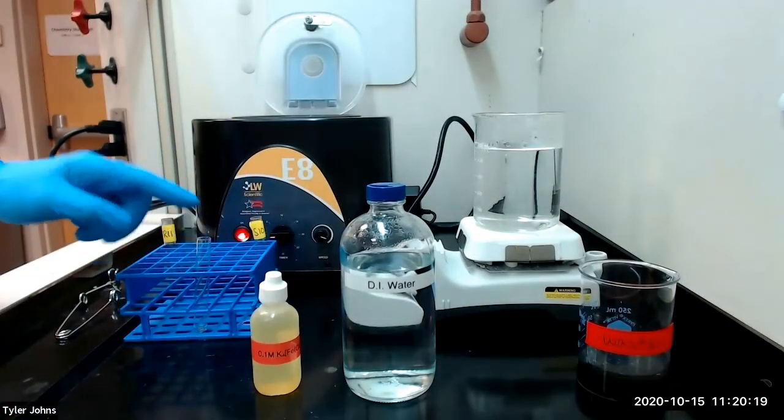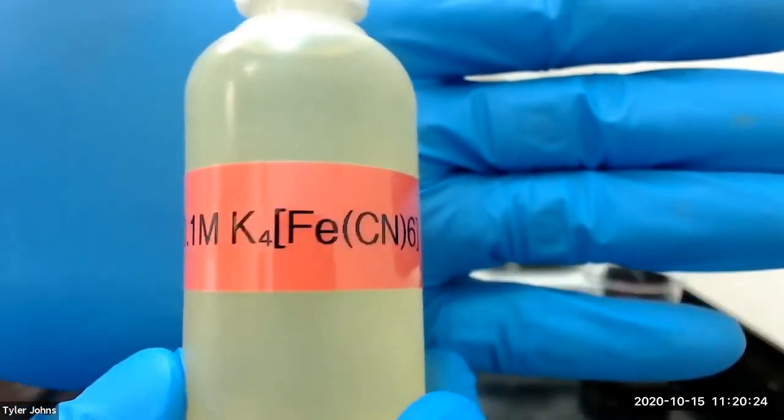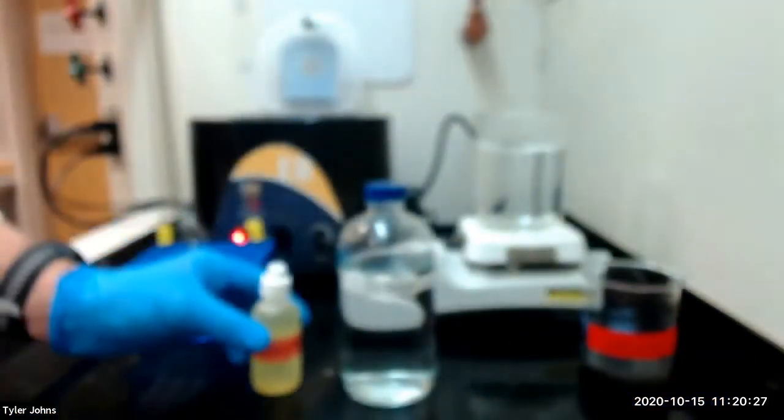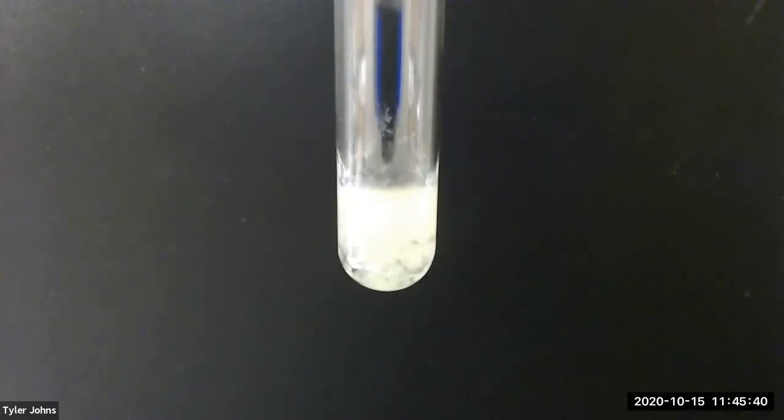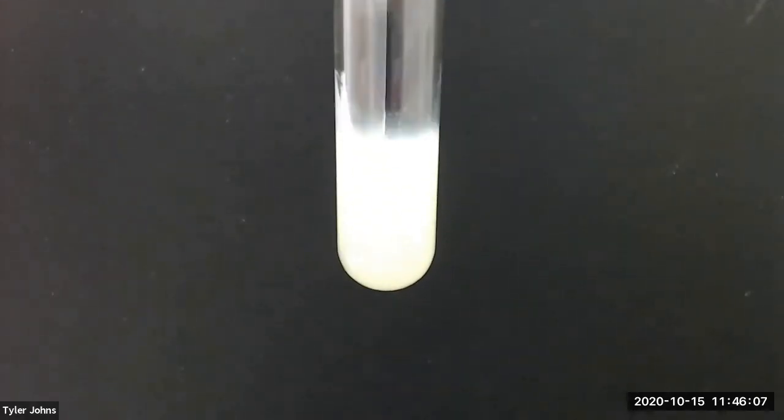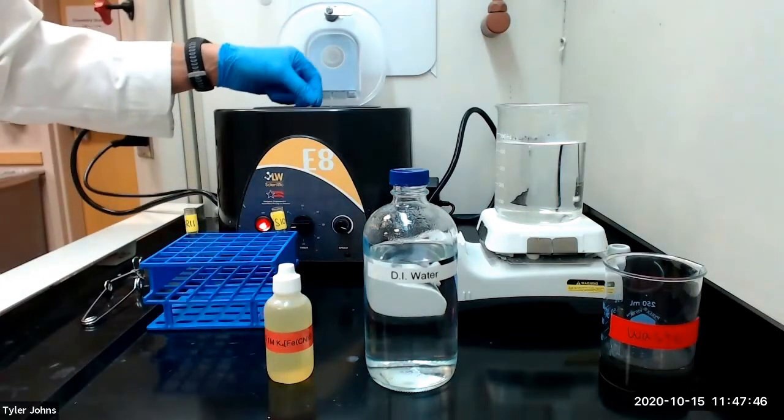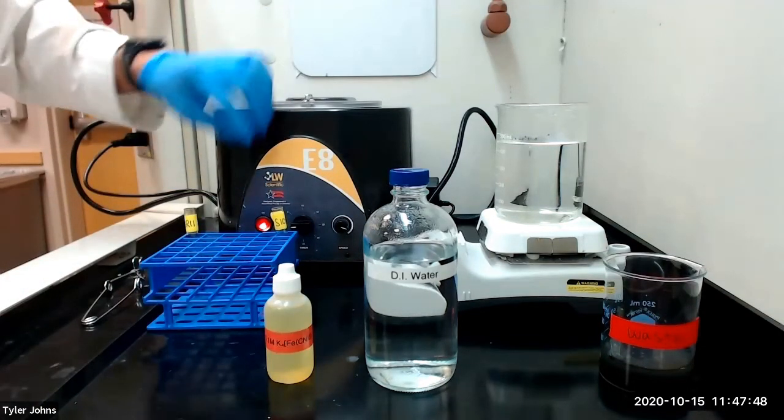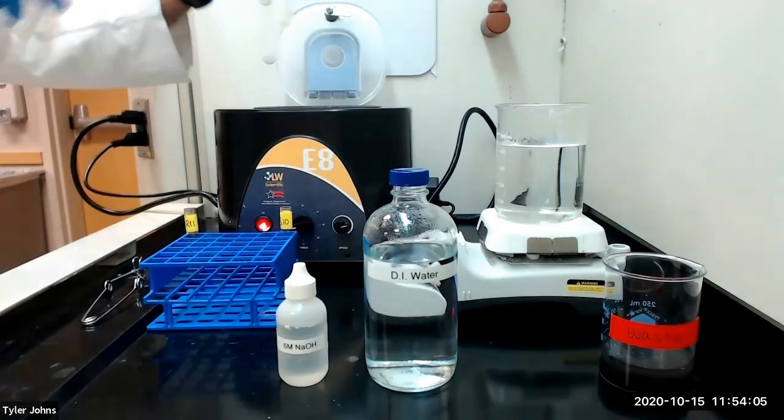To our clear solution, we will add 10 to 20 drops of 0.1 molar potassium ferrocyanide and stir well. We will then centrifuge our mixture. This is what our mixture looks like after centrifugation.